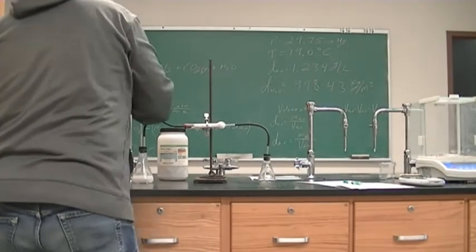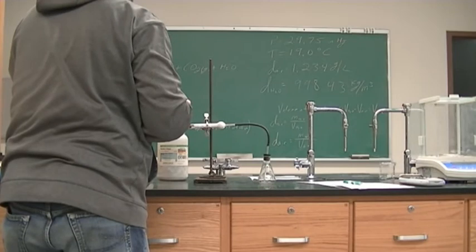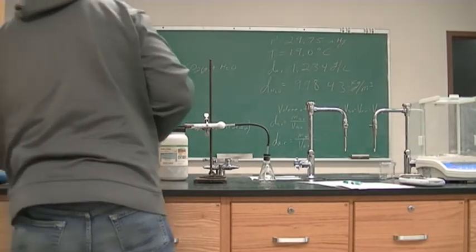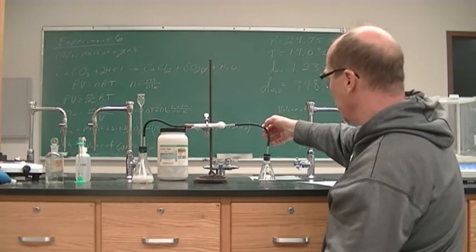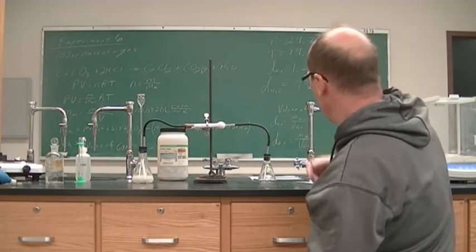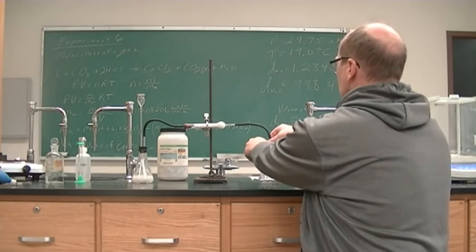More HCl. Got our CO2 generator going. Yep. All right, let's try it again. See if it's still going up.